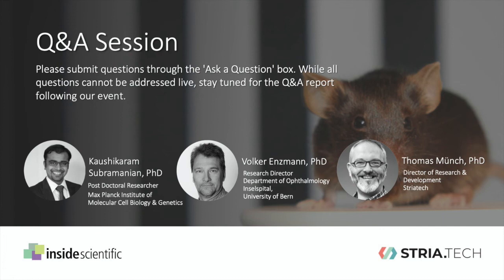Okay. Thomas, this next one is actually for you. Can all mouse lines be assessed with the optomotor measurements?